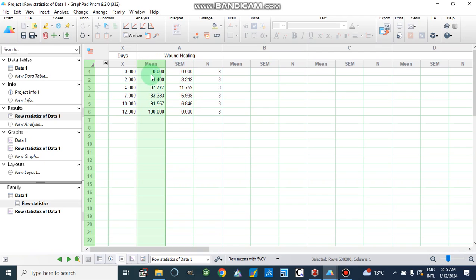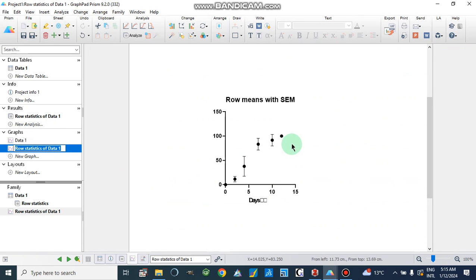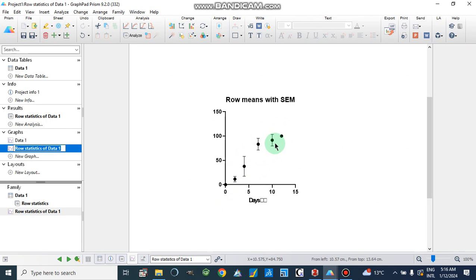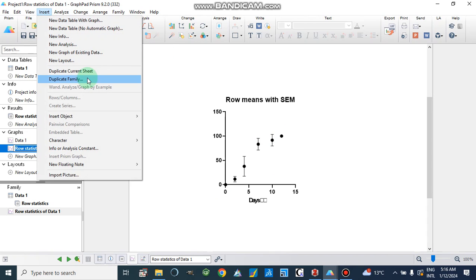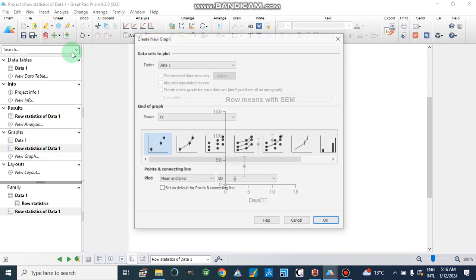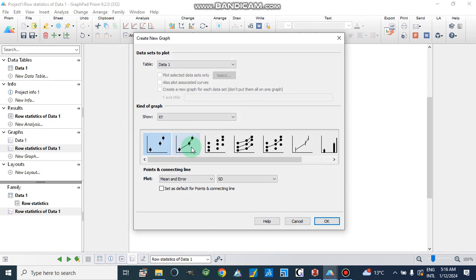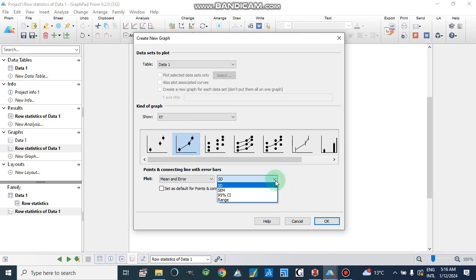Here we have the graph for row statistics — it shows row means with standard error of mean, and all these values are given for Group 1. We can change the type of graph from here. We can insert a new graph of existing data, and I am going to select the line graph with standard error of mean.